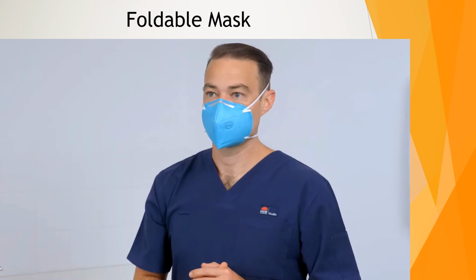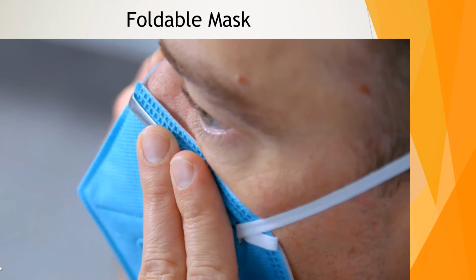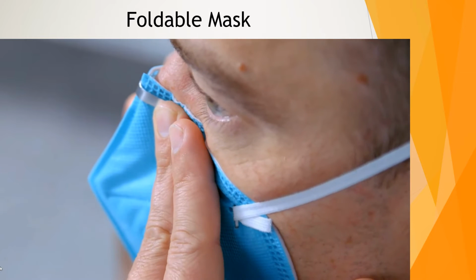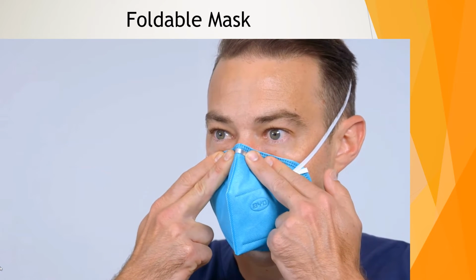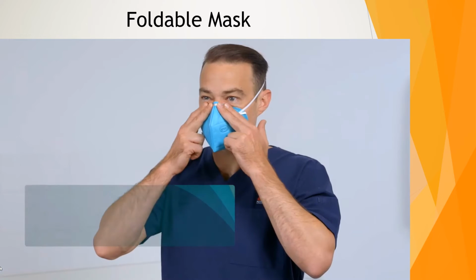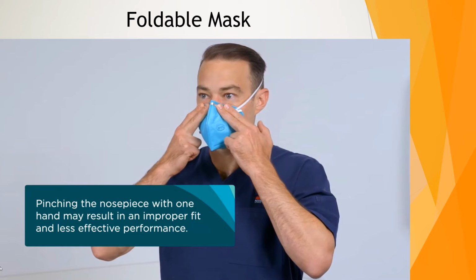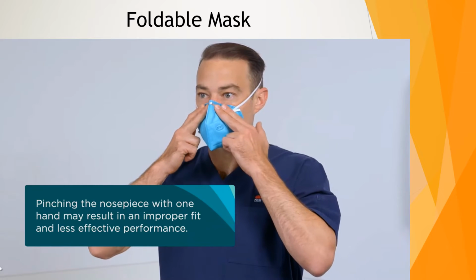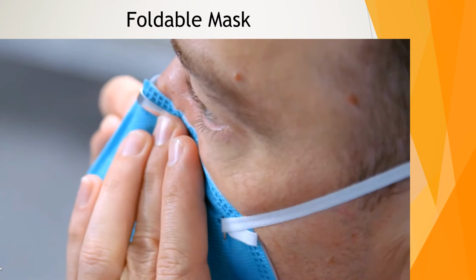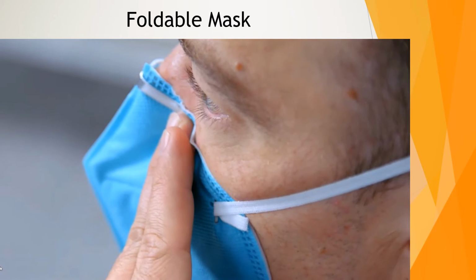Using both hands, mold the nose clip to the shape of your nose bridge by pushing inwards while moving your fingertips down both sides of the nose piece. Always use two hands when moulding the nose piece. Pinching with one hand may result in improper fit and less effective respirator performance. Conform the nose piece across the bridge of your nose by firmly pressing down with your fingers.